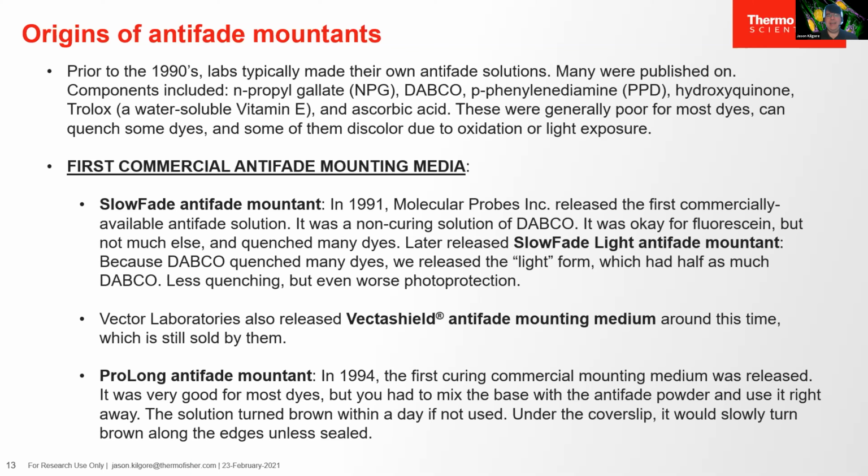And they were okay. They improved the stability of dyes. VectaShield from Vector Labs was also introduced around that time, and it was pretty good and still remains quite good. And then a few years later, we released ProLong anti-fade mountant. ProLong was, I think, the first anti-fade mountant that cured or hardened that was commercially available.